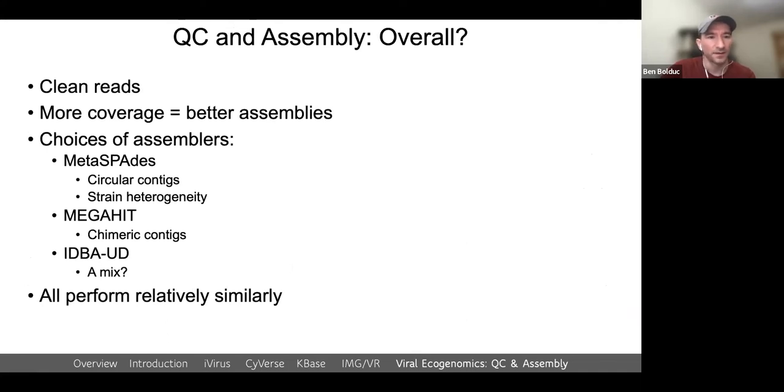Yes, okay. So that was my note to me to not talk too much about that. So to summarize, clean your reads. Doesn't really matter how you do it, just clean them. More coverage up to a point gives you better assemblies. You can choose whatever assembler you want to use, but they each have their own strengths and weaknesses.